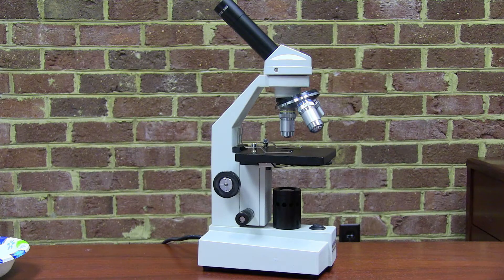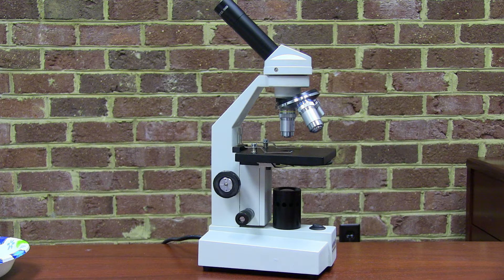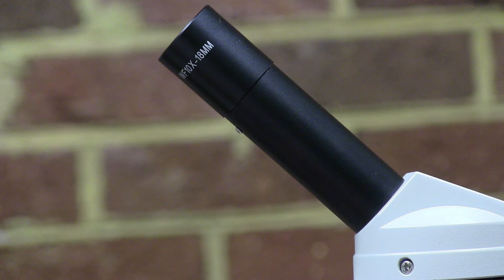Let's begin by learning the parts of the microscope. First, the eyepiece is the tube that connects the ocular lens to the head of the microscope.